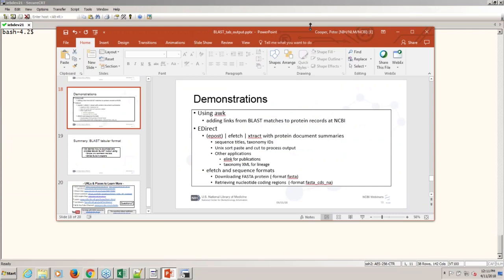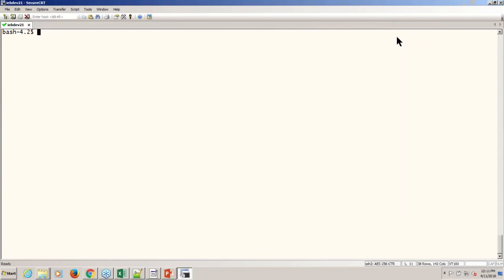And if you want to follow along, you can try, or if you want to see what I'm doing, there are a number of different files on the FTP site that are in that link. But you don't need to do that. I'm just going to be playing along with that, and you can follow. What I'm going to do is show you a lot of the times we're going to be working on this command line here.